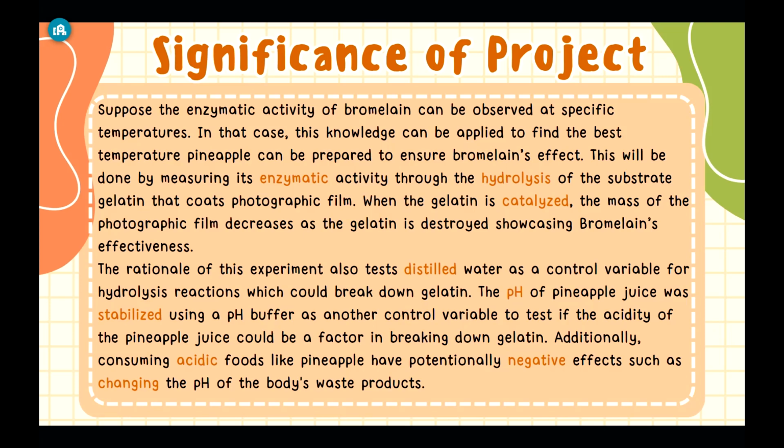The rationale of this experiment also tests distilled water as a control variable for the hydrolysis reactions, which could break down gelatin. The pH of pineapple juice was stabilized using a pH buffer as another control variable to test if the acidity of the pineapple juice could be a factor in breaking down gelatin. Additionally, consuming acidic foods like pineapple have potentially negative effects, such as changing the pH of the body's waste products.